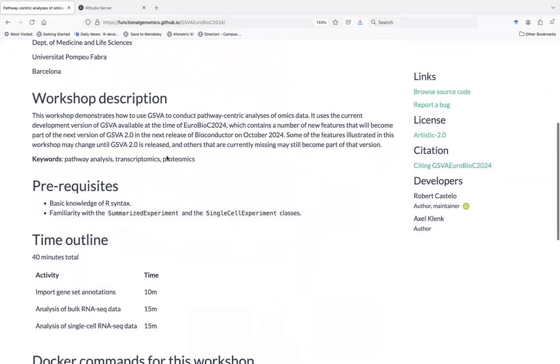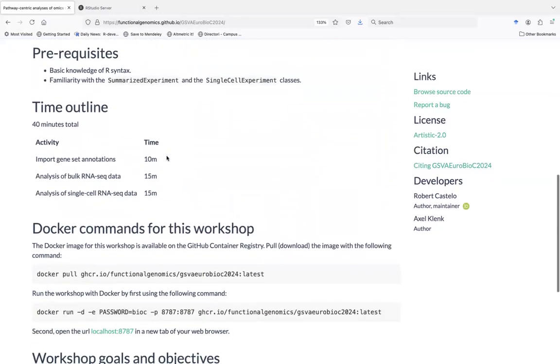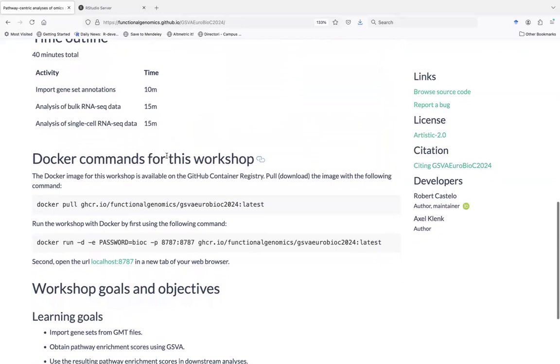Perfect. I propose that you use these Docker containers that you can pull here, if you're using Docker at all, because they will have the right environment and our version to make things work.